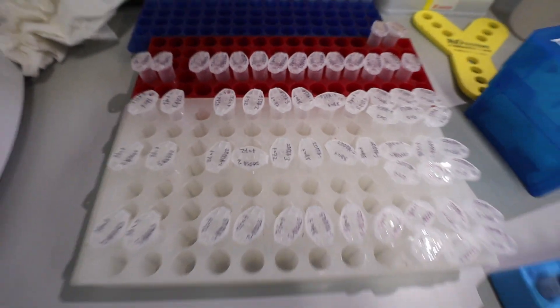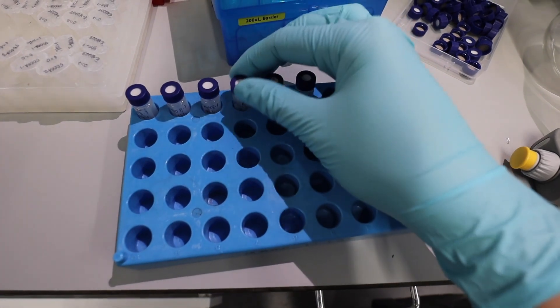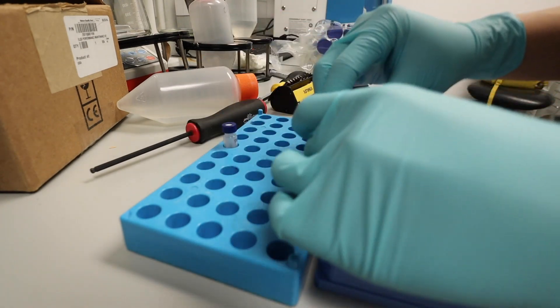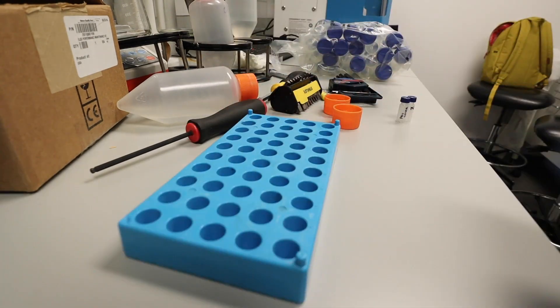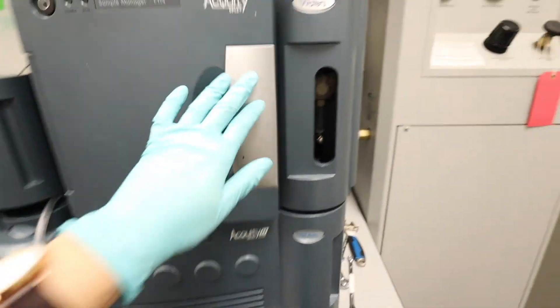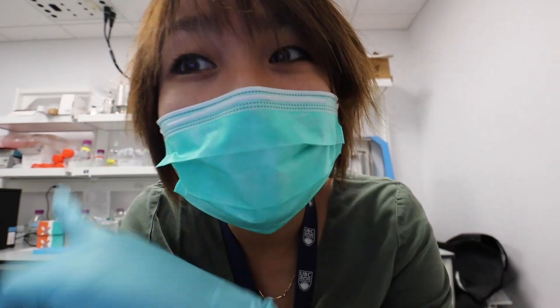So many samples. I'm just gonna run these six first at the latest time point just to check if it's actually working. Okay, so while this is running, I'm gonna go prepare the rest of the bazillion samples.